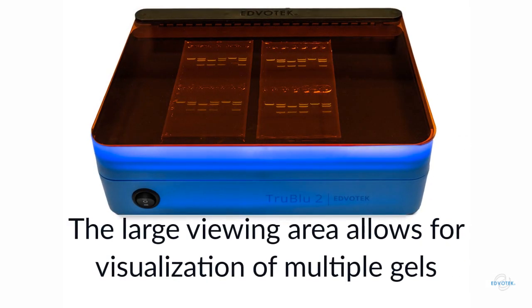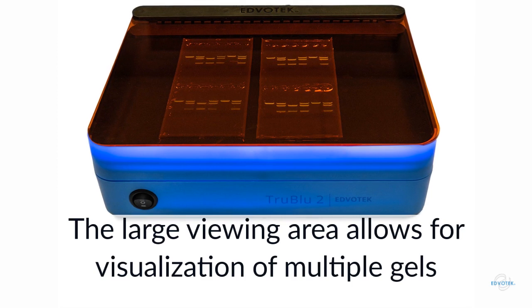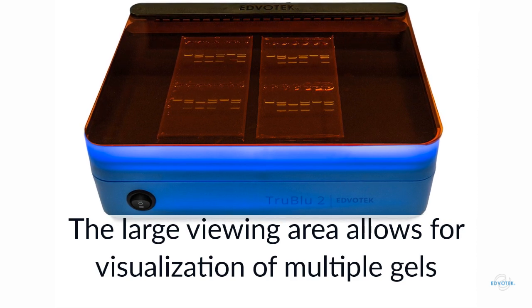With a large viewing area, the True Blue 2 Transilluminator is perfect for use in any lab setting. The large viewing area can accommodate gels of varying lengths, widths, and thicknesses. It also allows for the simultaneous viewing of multiple gels, great for large classes and for comparing results.